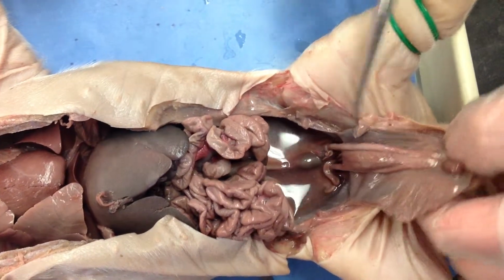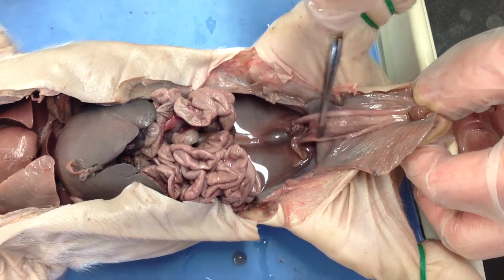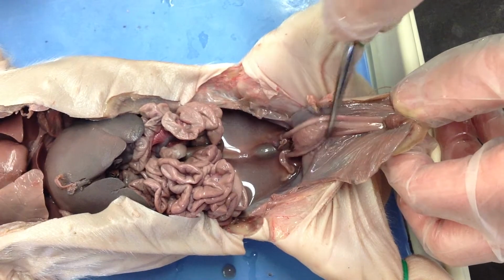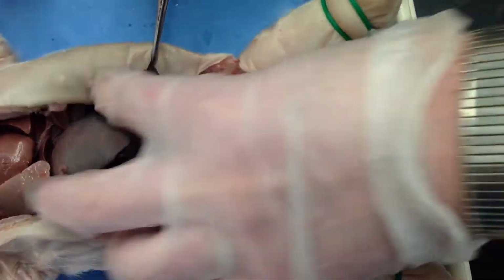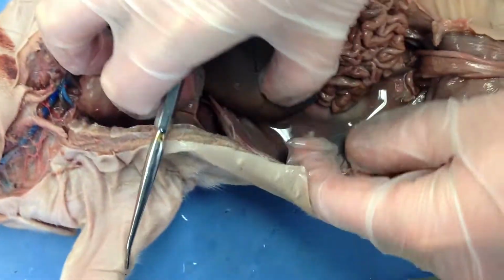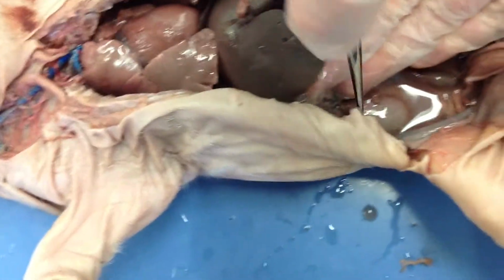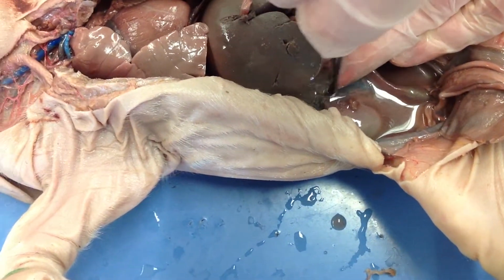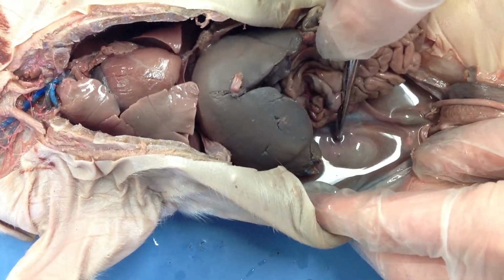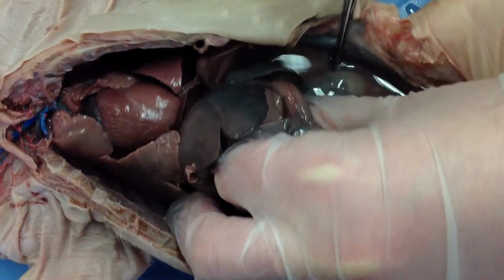Right here you can see the urinary bladder, and the urinary bladder is in between the 2 umbilical arteries on either side. Okay, if we look at the back wall of the abdomen, we should have the kidney on the back wall. So here's the right kidney. Remember, the orientation is reversed. It's from the fetal pig's point of view. So under all this fluid here is the right kidney, and the left kidney is over here.